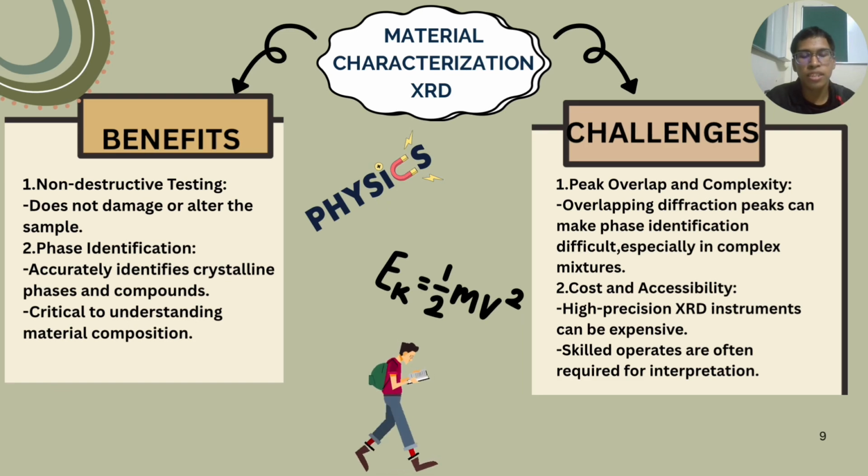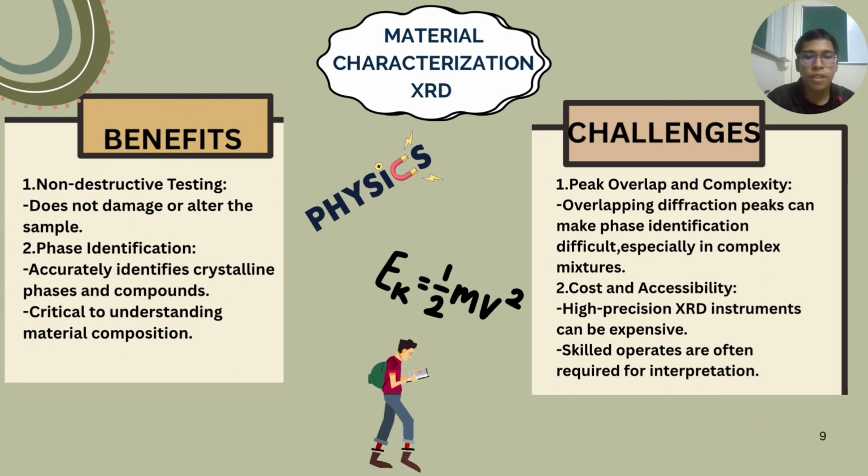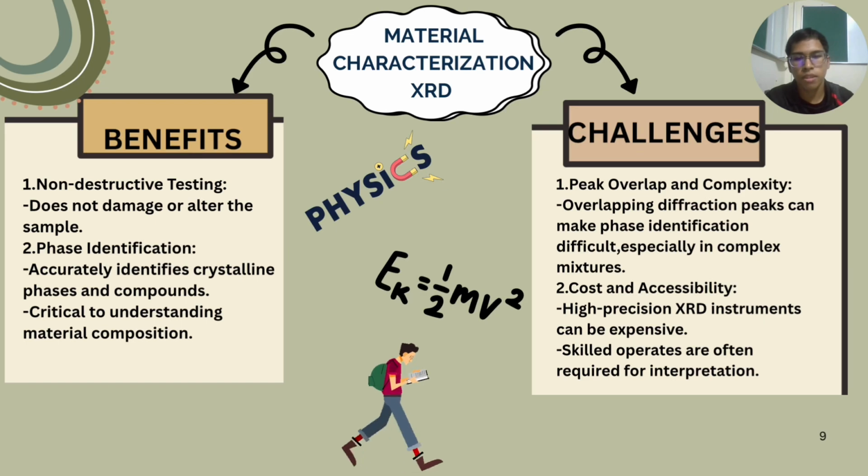High precision XRD instruments can be expensive and often require skilled operators for interpretation, which means you can usually find this instrument only in well-funded institutions.